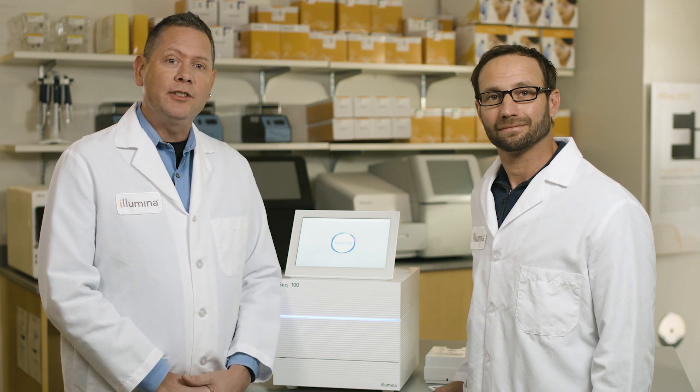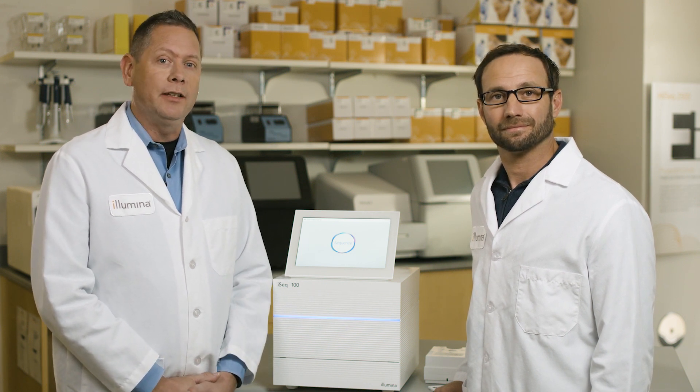The iSeq 100 leverages some of our greatest technological advances in our smallest and most accessible system to date. Building on our trusted SBS chemistry and combining it with our latest single-channel CMOS detection technology, the iSeq 100 offers researchers a compact and cost-effective benchtop sequencing solution. The iSeq 100 is easy to use and provides up to 4 million reads in about 17 hours for a 2x150 base pair run.